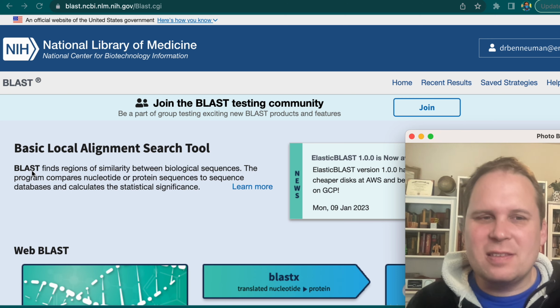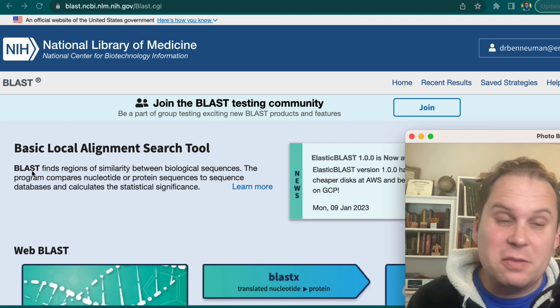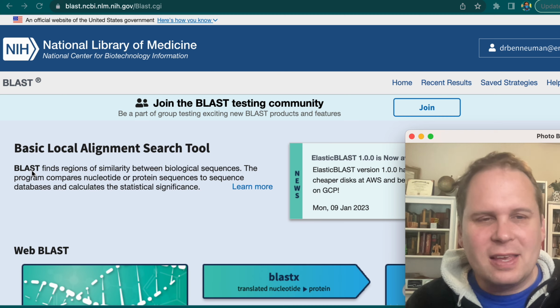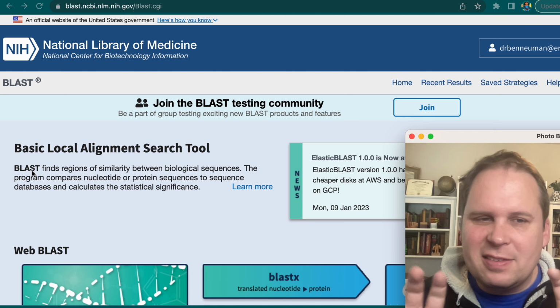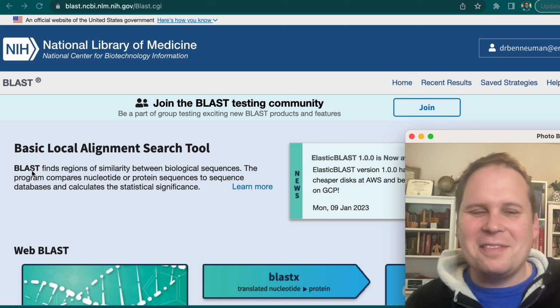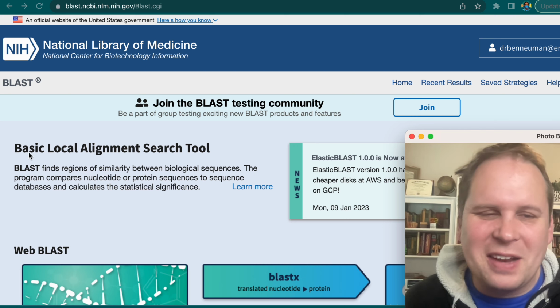This is the most successful DNA search engine that exists in the world, and also protein search engine and also RNA search engine. And the nice thing is you don't have to differentiate between RNA and DNA. You can put them all in as if the U's are T's. So you just use T instead of alternating, or whatever. You can feed in U's and it'll figure it out, I think.